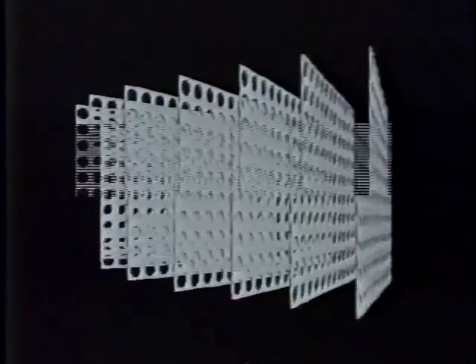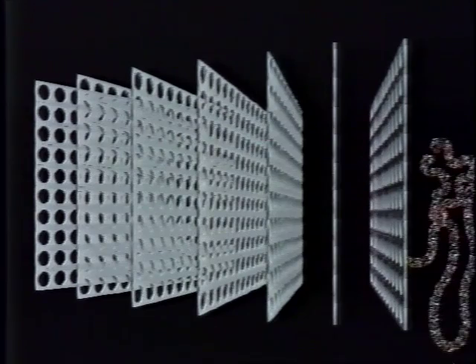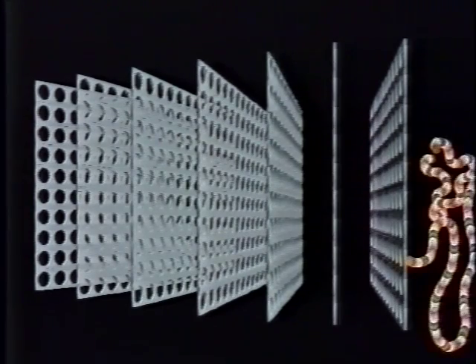The type of macromolecule you wish to separate will determine which gel substrate to use for electrophoresis. The material used to separate macromolecules having a mass greater than 10 kilodaltons is agarose, made from seaweed. Agarose gel has a relatively homogeneous pore size, which makes it particularly useful for separating elongated macromolecules such as nucleic acids.